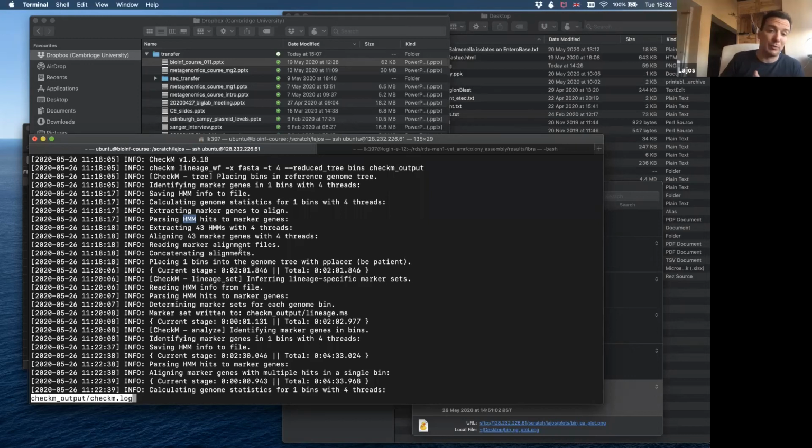For example, we had this case with my part2 student when we were analyzing Staphylococcus chromogenes genomes, which were cultured from milk, from cows with some kind of mastitis.